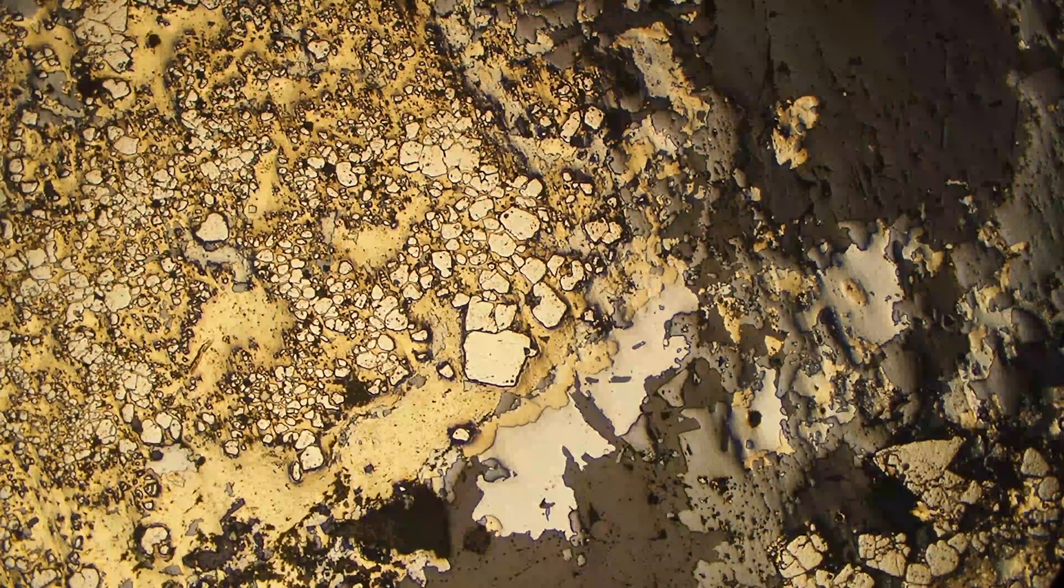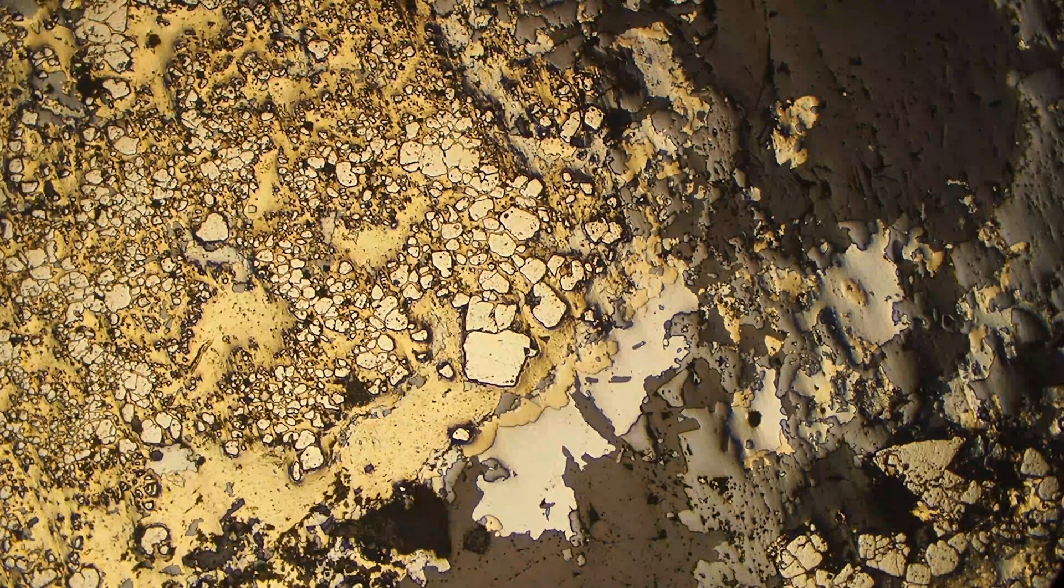Next we're going to be switching over to a sample that has some other minerals so we can see how it looks in comparison to them.